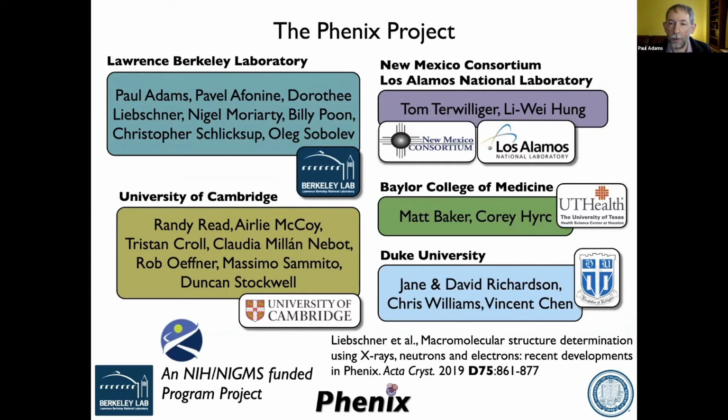All right. Just to add to it, map-model FSC has a very distinct shape across most maps and models I've ever seen. So if you look at 10 or 100 FSC curves, you'll train your eye to know what a good one looks like and what a bad one looks like. So I guess just look at many and then you'll know.